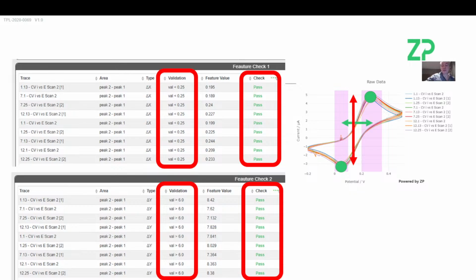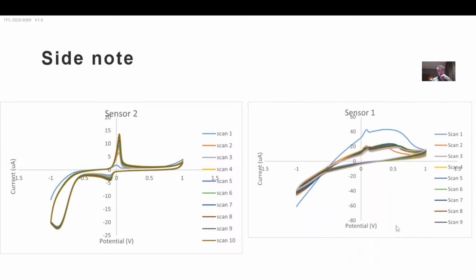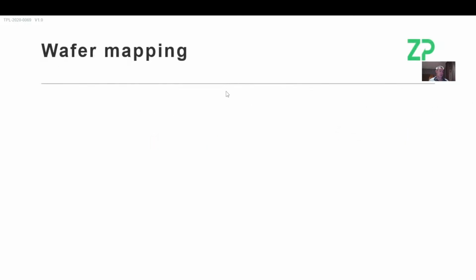And what these electrochemical methods are doing is it's really telling us a lot of things about print and a lot of things about conductivity of tracks, but it's then also telling us this critical interface between the electrode and the liquid. And none of the other methods really do that. And the nice thing is, if there's also gross issues, this is, by the way, silver contamination of the working electrode. That's a gross issue. This is a very poorly conducting track. We'll just see it straight away, and that can be rejected. But you won't necessarily see that silver contamination by even visual inspection, and you definitely wouldn't see the poor conductive track by visual inspection. But we can pick them up by electrochemistry.